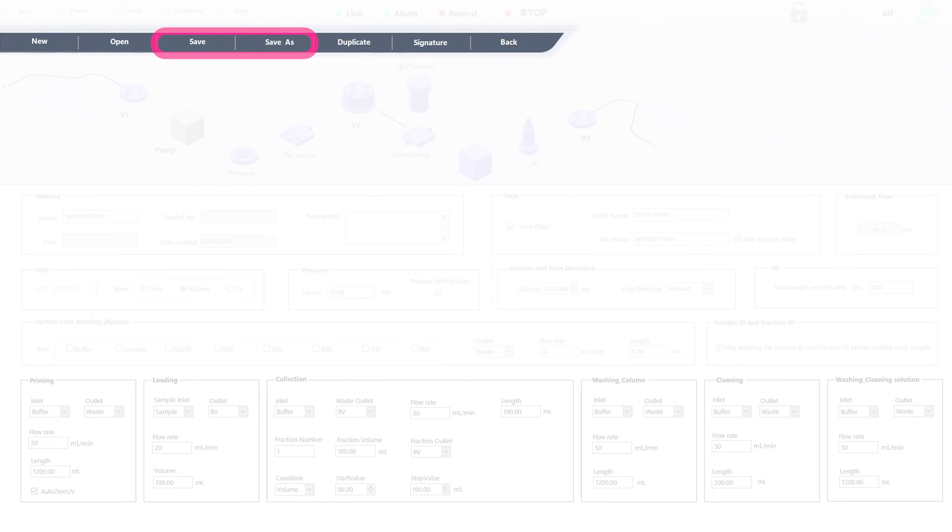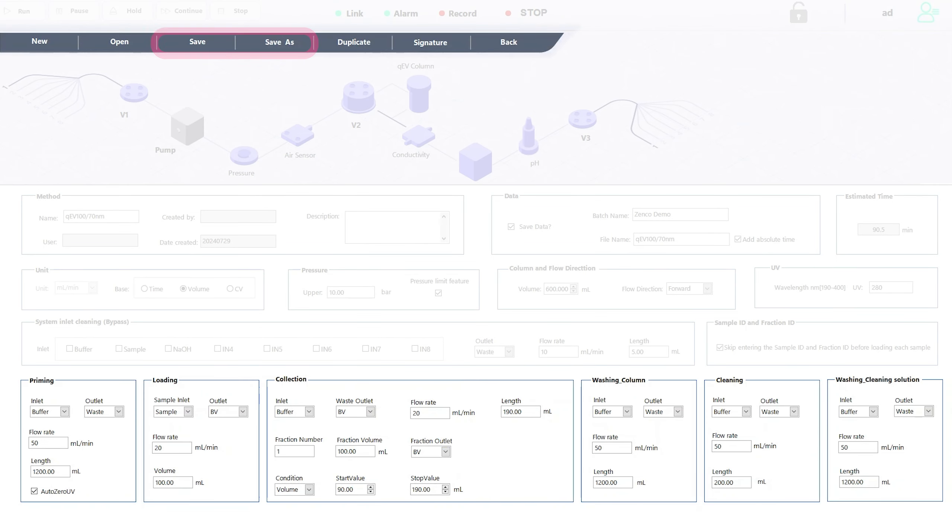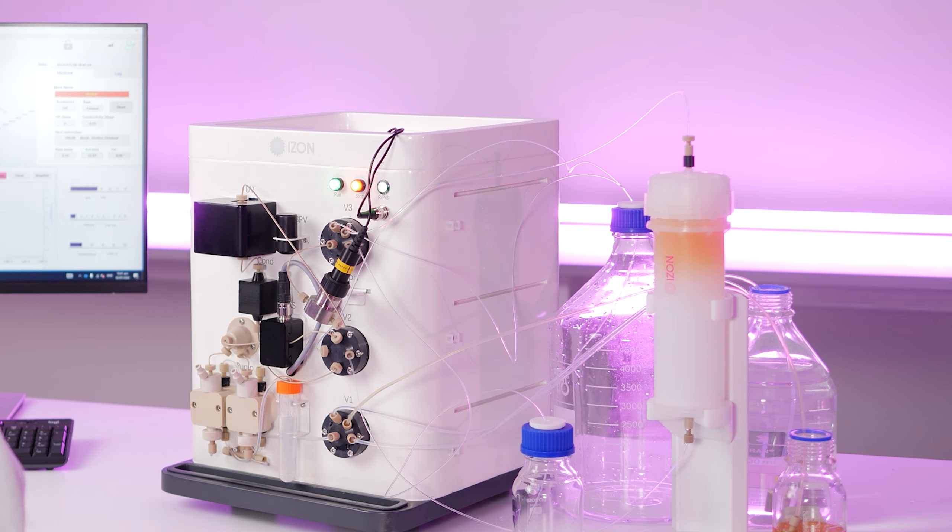You can also save and import method setups for future runs, saving valuable time.